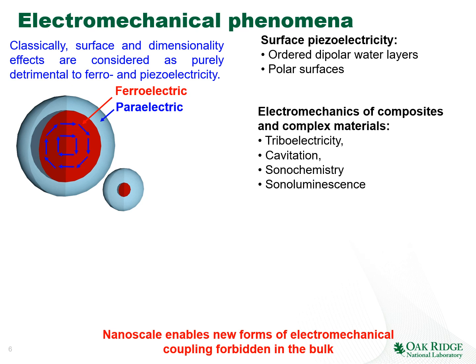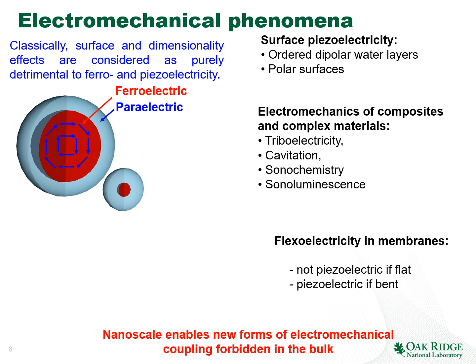Sometimes in the ferroelectric materials we can have very unusual polarization ordering. For example, the Laurent Bellaiche group predicted that ferroelectrics will sometimes develop the highly unusual toroidal state. And if you are tracing the literature now, meaning 2019, these toroidal states are actually extremely important and are studied by the Berkeley group.